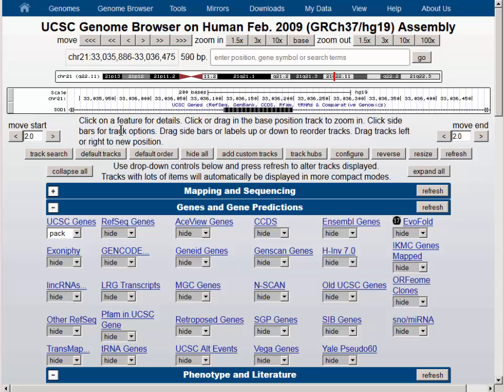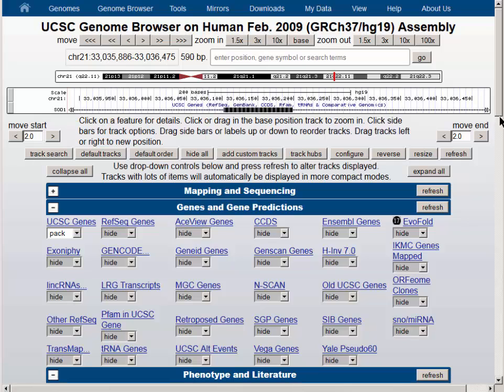So if you were zoomed into such an exon and you were interested to know which exon number it was, you can put your mouse over the double-headed arrows to the right or left of the screen. The previous exon is number one, and the next exon is number three.